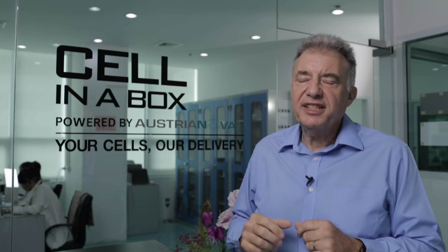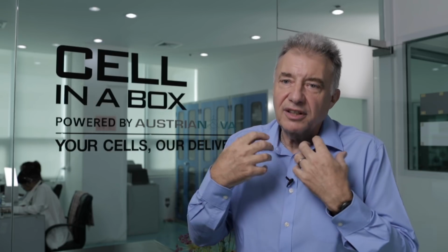So when you set up a manufacturing process, you have to run it through with cells to be sure that it works and does what it's supposed to do. At the time we started this manufacturing process, the only cells we had available were the so-called research cell bank, which was made for the PharmaCyte product. So we set up the whole manufacturing process based upon the research cell bank. That means we tested how fast the cells grew in particular conditions. We tested the right environment for the cells in terms of the temperatures, the speed of movement of the cells, etc., to give the best possible product.